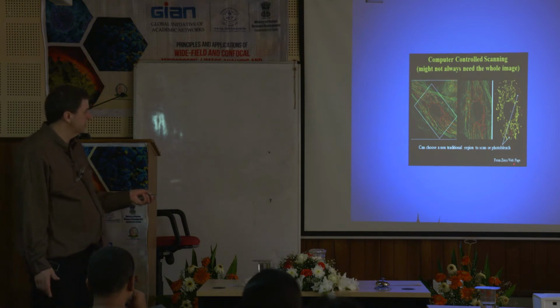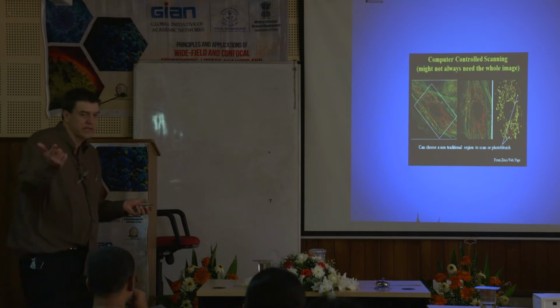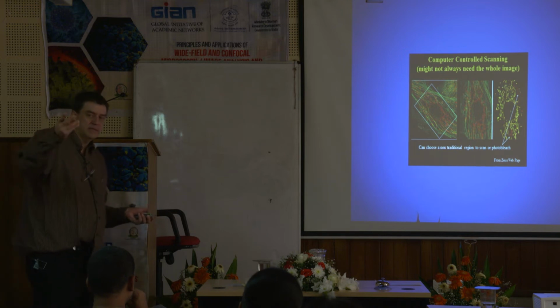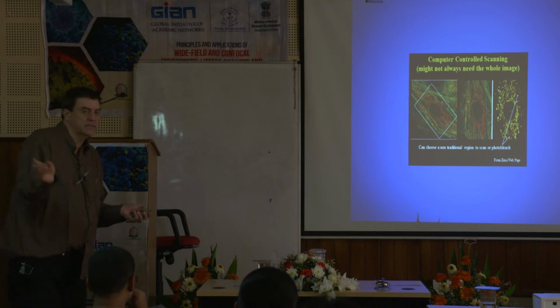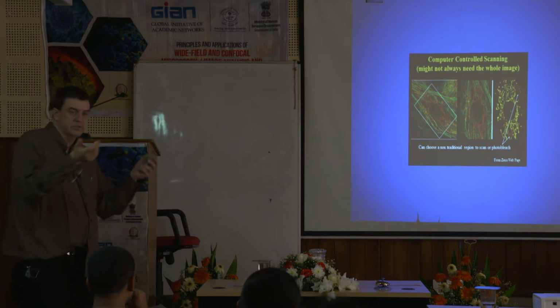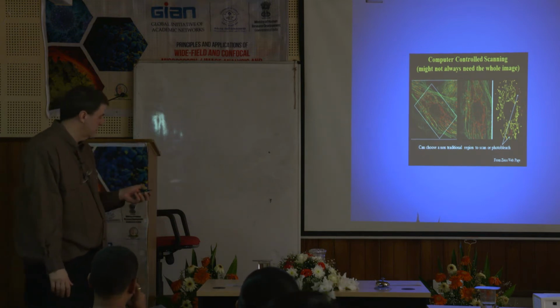This one I used from the Zeiss webpage, another microscope company. There's basically 4 microscope companies. There's Nikon and Olympus, which are both Japanese companies. And then there's Zeiss and Leica, which are both German companies. There is no American company, and there's really nobody else in the world. So the Germans and the Japanese are your microscope manufacturers.